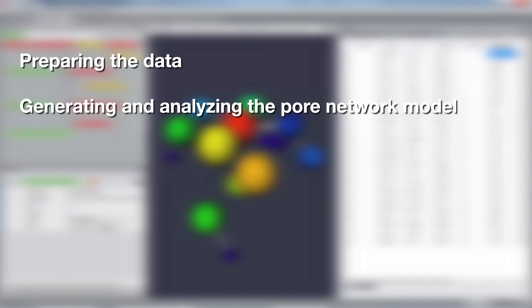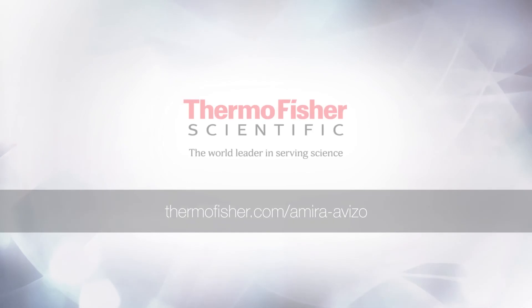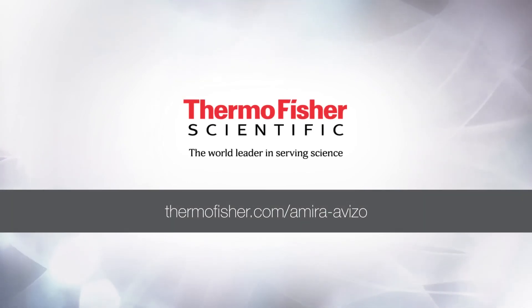As a summary, in this tutorial you should have learned how to prepare data for doing a pore network analysis and then generating and analyzing the pore network. Goodbye and thank you for viewing this tutorial.